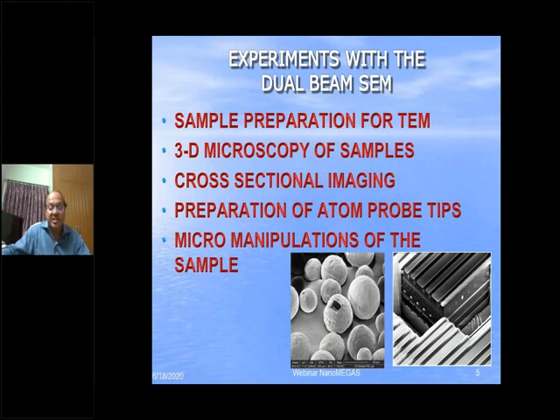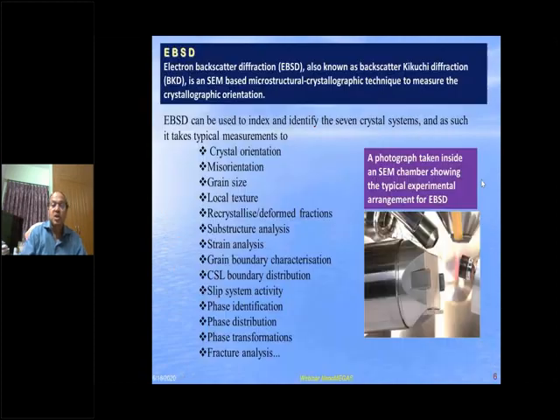Three-dimensionally, these are the powder particles. You can look at them. Each powder particle, which we basically use to make consolidated materials. Similarly, we can also find out what is inside each one of them. You can cut open powder particles, which we apply even on our face. We can open each one and start seeing the structure inside. We can do manipulation using a tip, and various other examples can be used to find out.